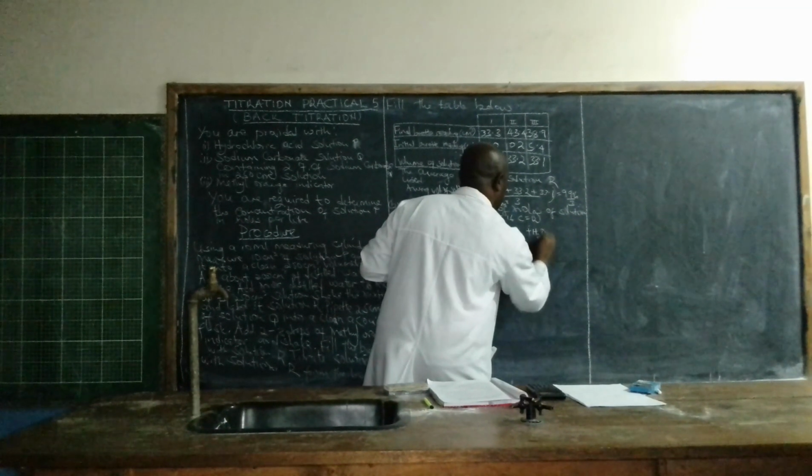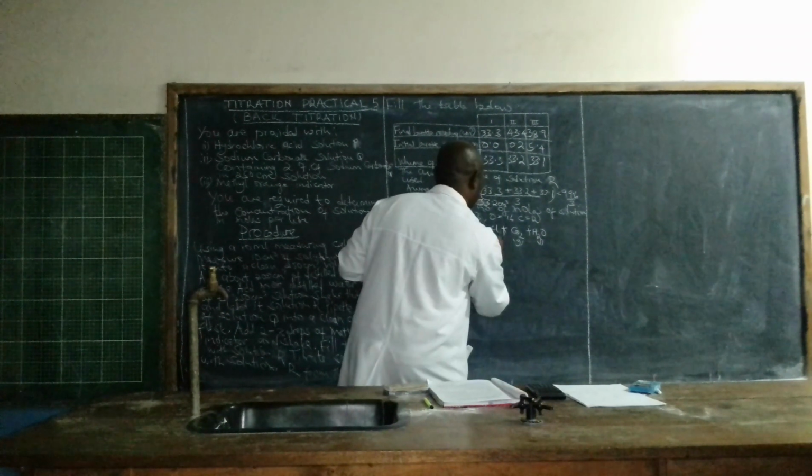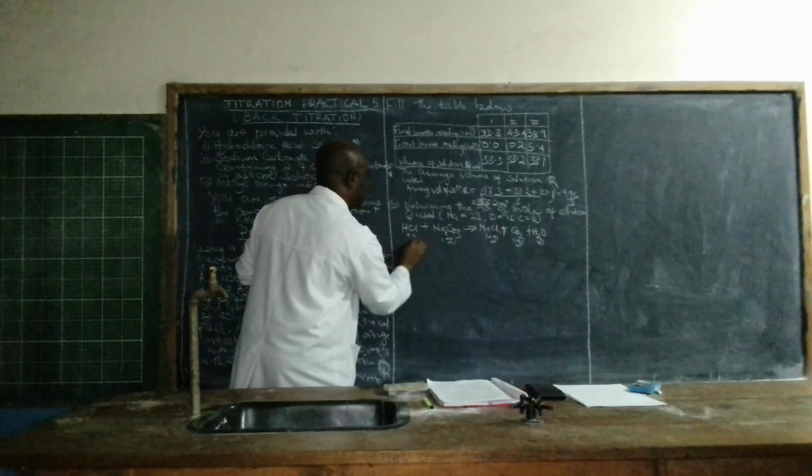These are liquid, this is gas, and the others are aqueous.